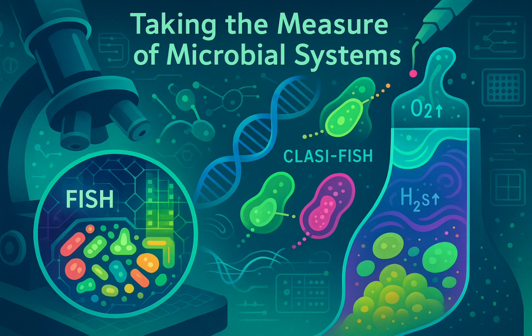Laser tweezers. What's that? Okay. You use a focused laser beam, like tiny optical fingers under a microscope, to physically grab a single cell you're interested in and just pull it away from everything else. Wow, like microscopic fishing. It's a perfect analogy, yeah.